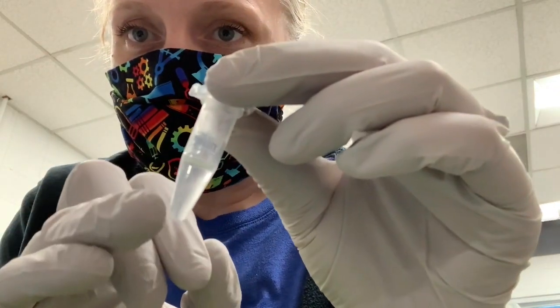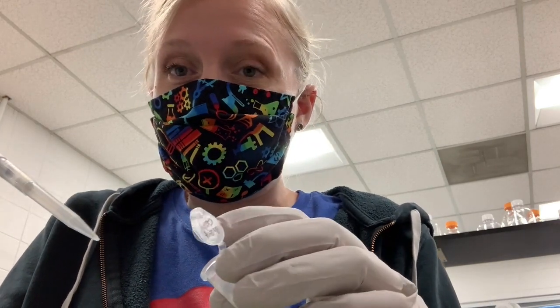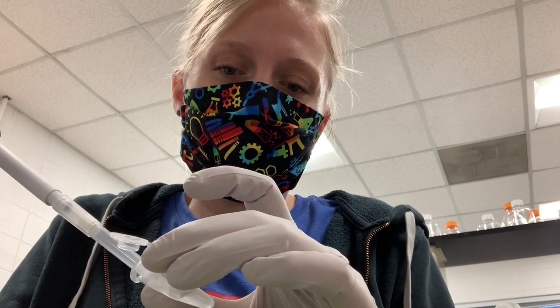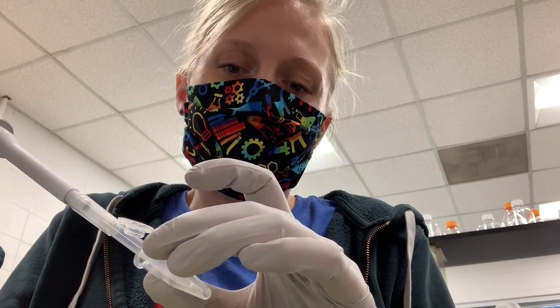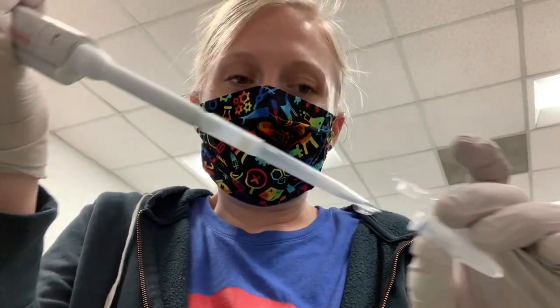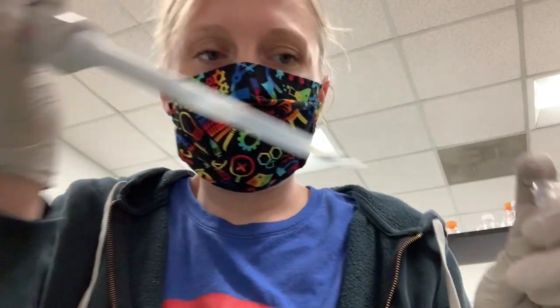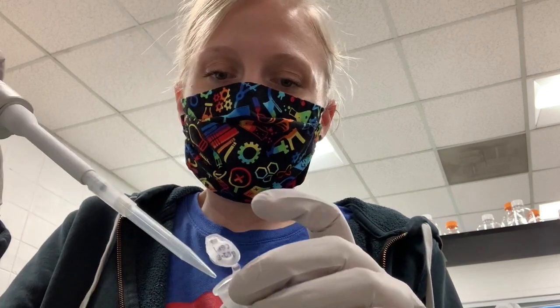So after the second spin, you should again see your pellet on the side of the tube. And this time we really want to remove all of the supernatant so that we can allow these pellets to actually dry. If you left ethanol in these pellets, they wouldn't dry, and that would interfere with your downstream applications. So first I'm using my P1000 tip to remove as much of the liquid as I can. Then I'm going to do just a pulse spin in the centrifuge.